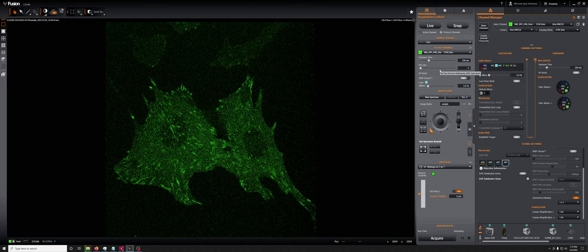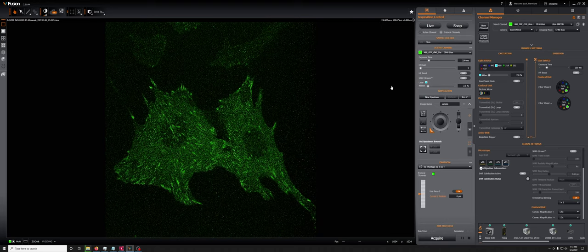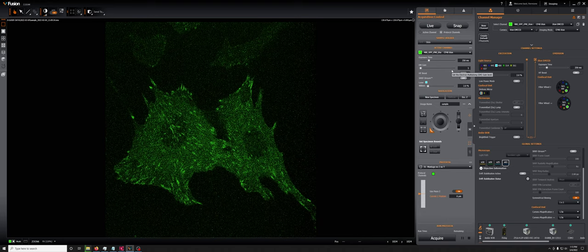I have here a sample kindly provided by the Bayer lab where some cytoskeletal pretty dim proteins are labeled with GFP. And I just want to show them as an example of how you use the EM gain to get better images.